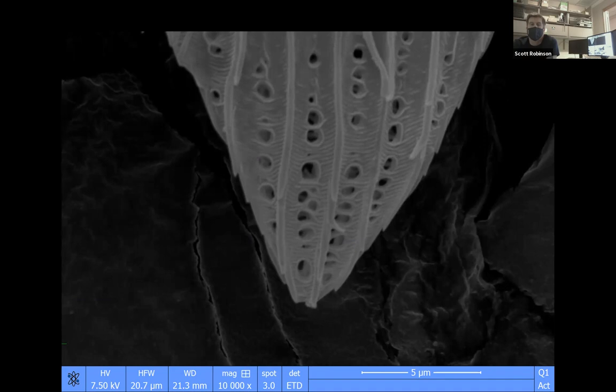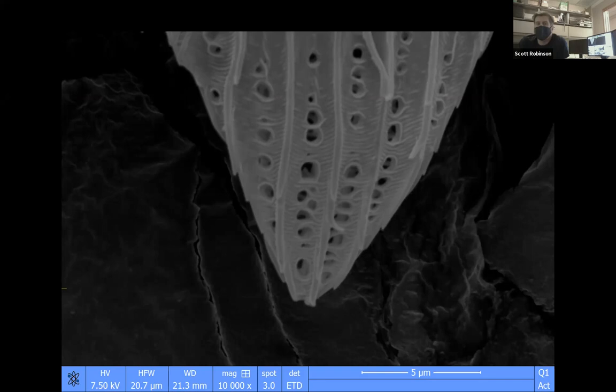And what we wanted to do was make it so that the microscope could be connected to the World Wide Web, because in 1998, 1999, things were different. We had some really good coders here. And what we did was we were able to control the scanning electron microscope using computers, and take images from the electron microscope and put them online.